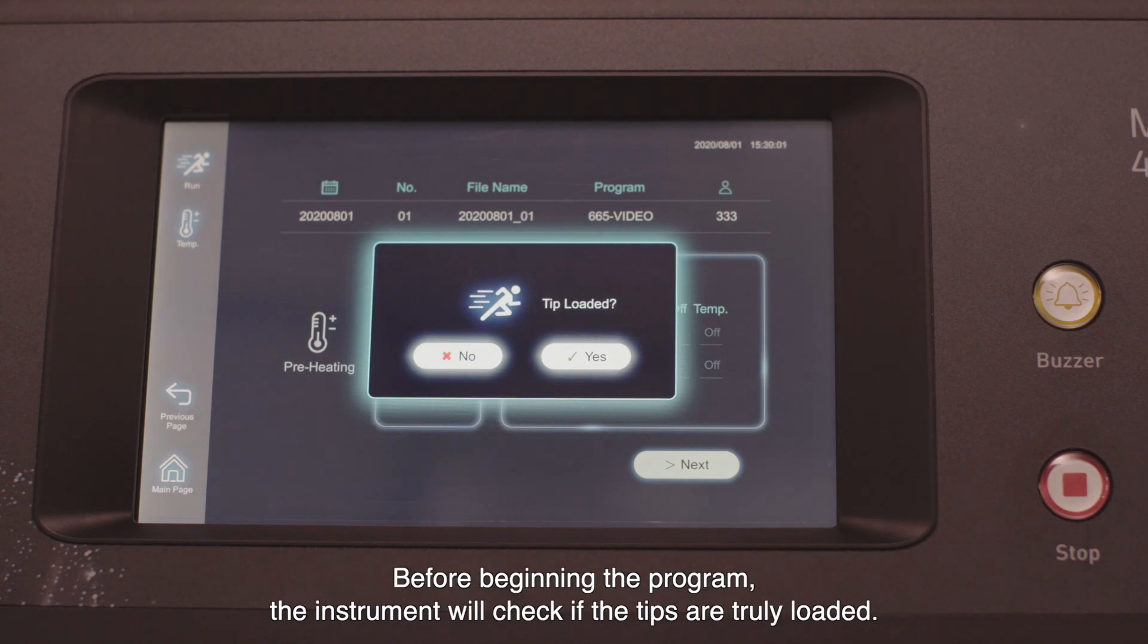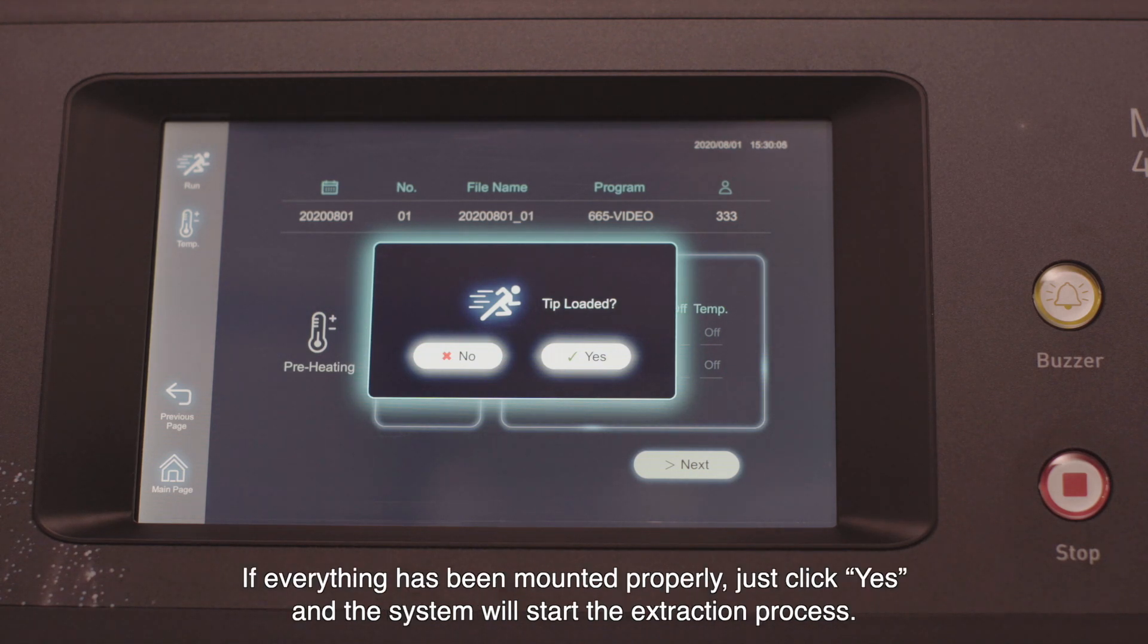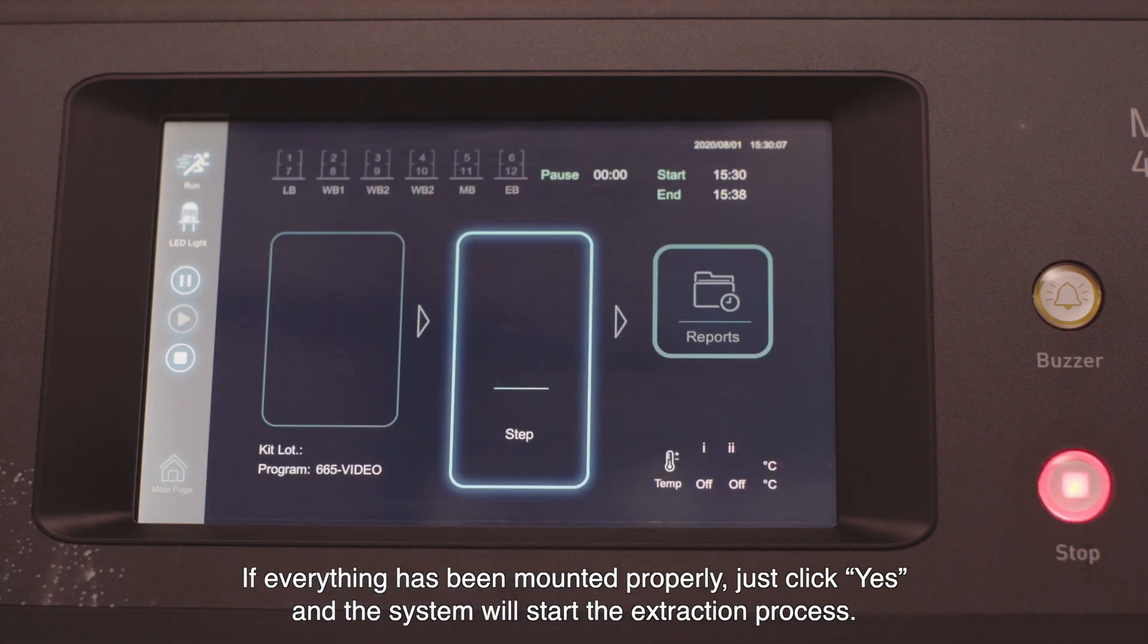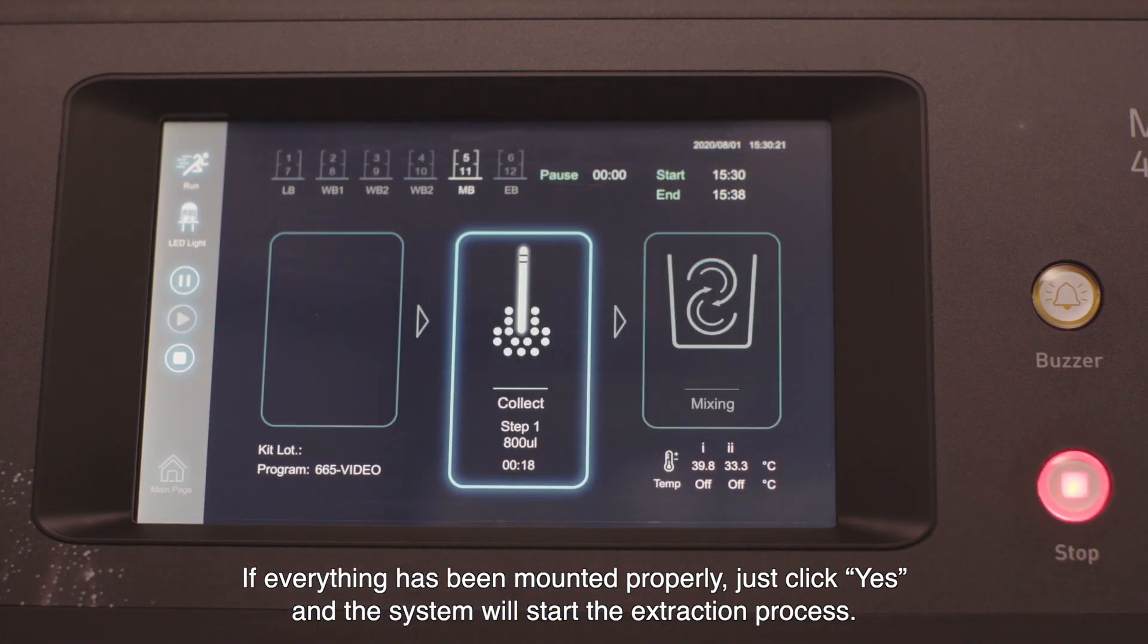Before beginning the program, the instrument will check if the tips are truly loaded. If everything has been mounted properly, just click yes and the system will start the extraction process.